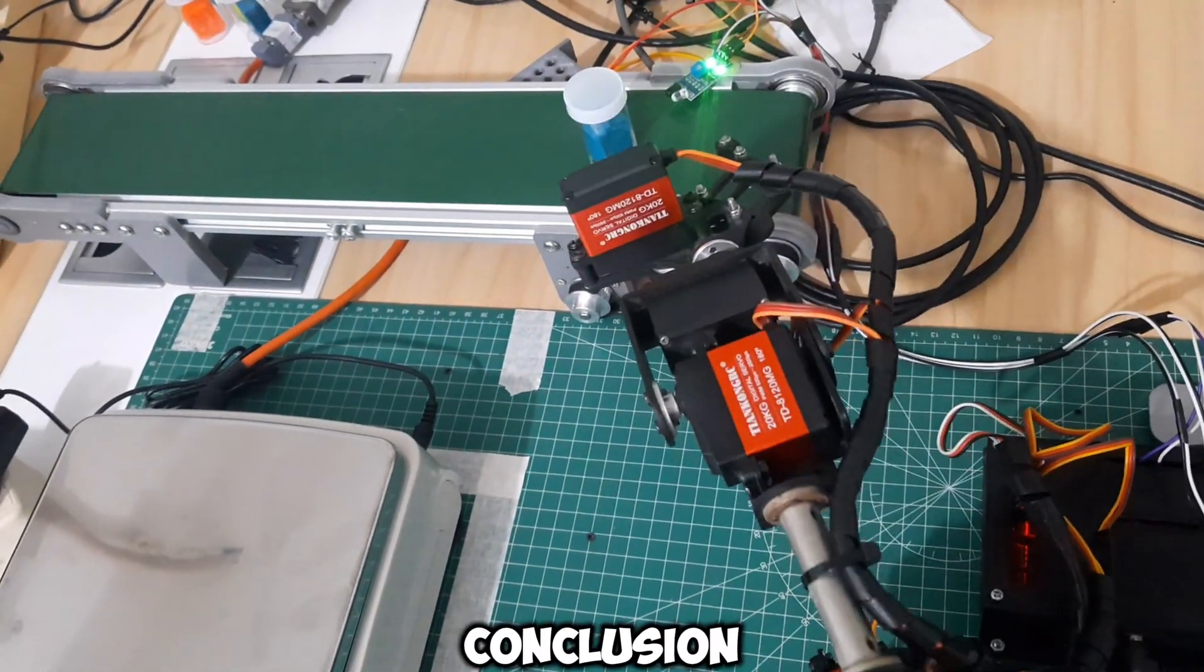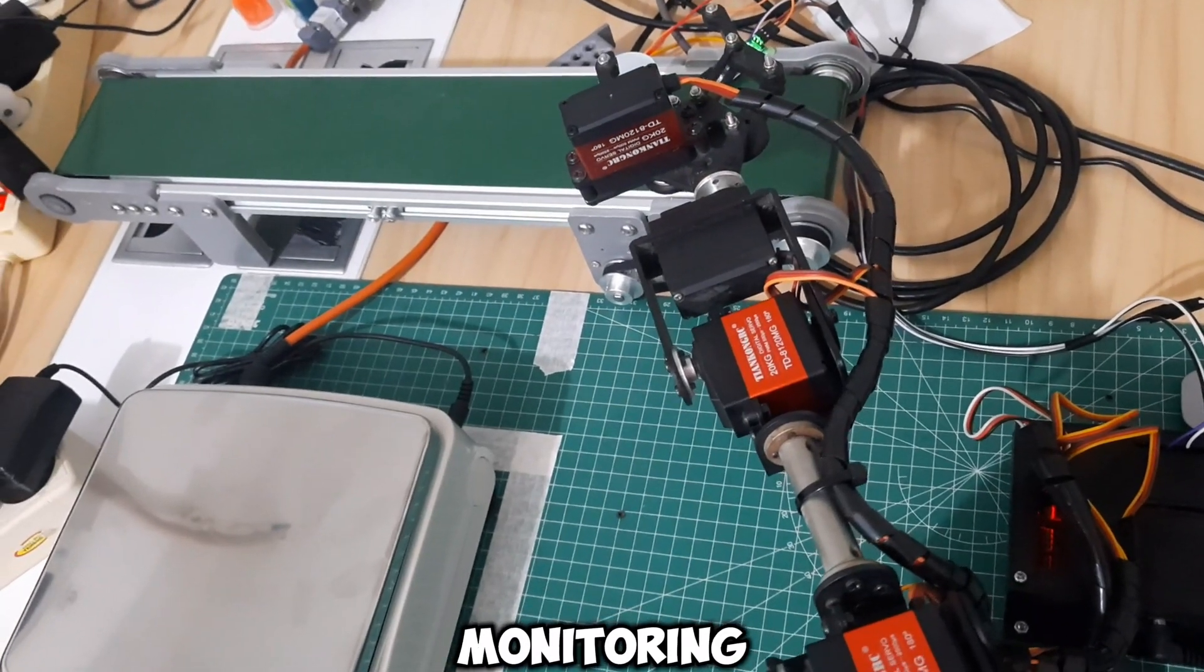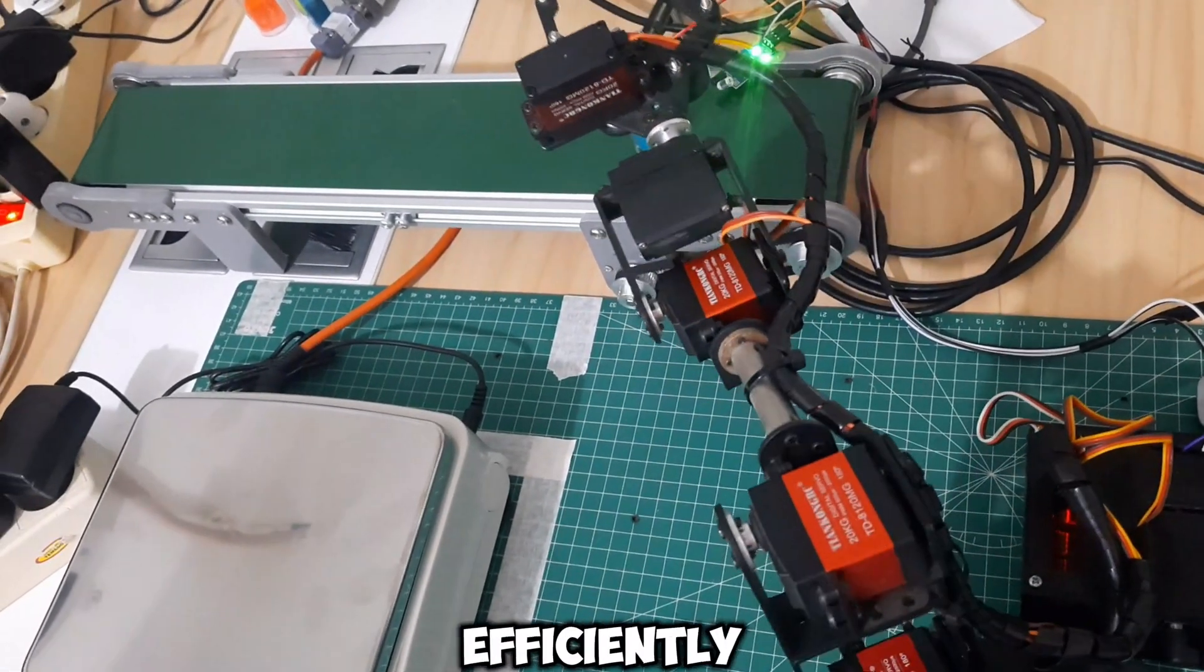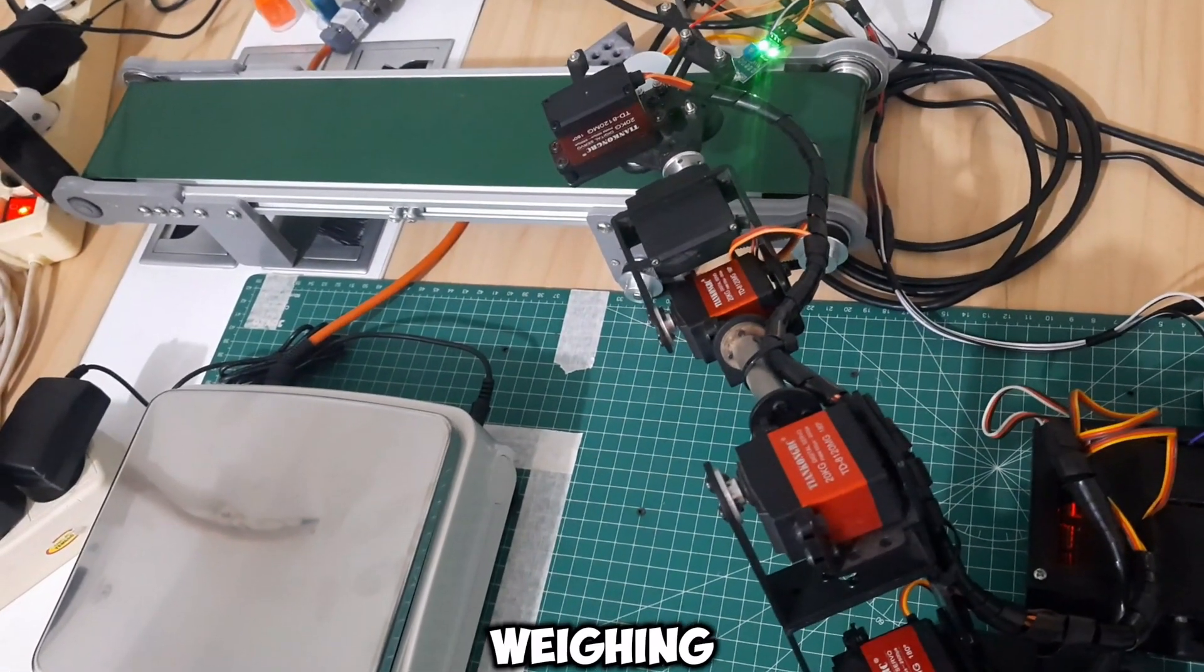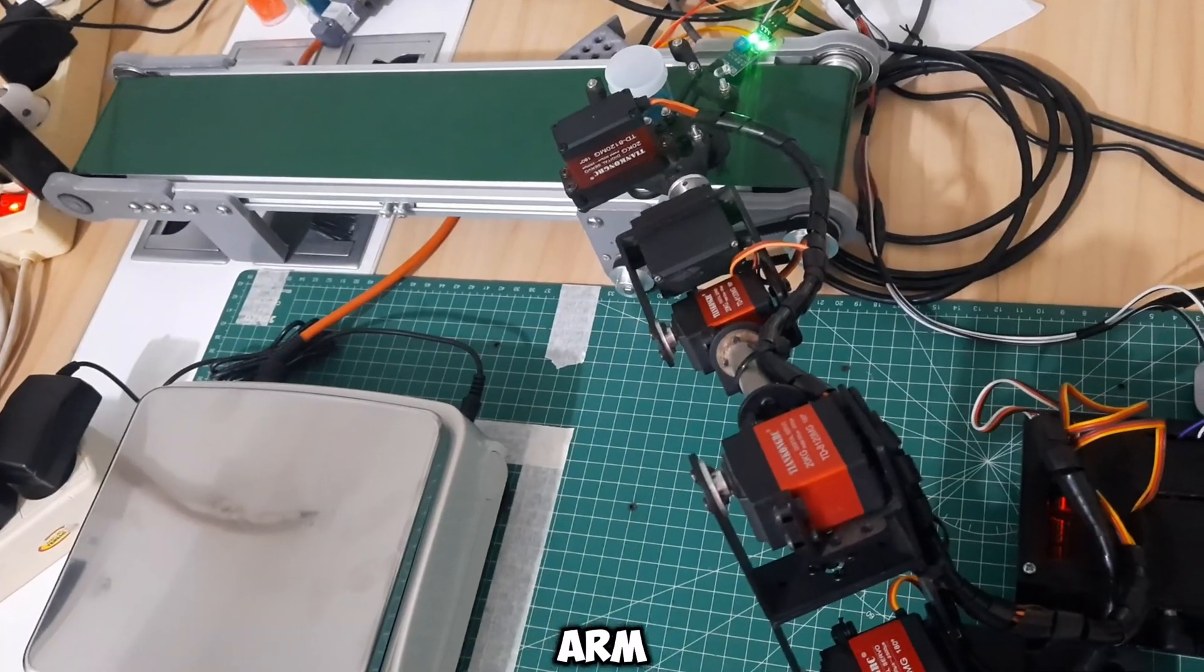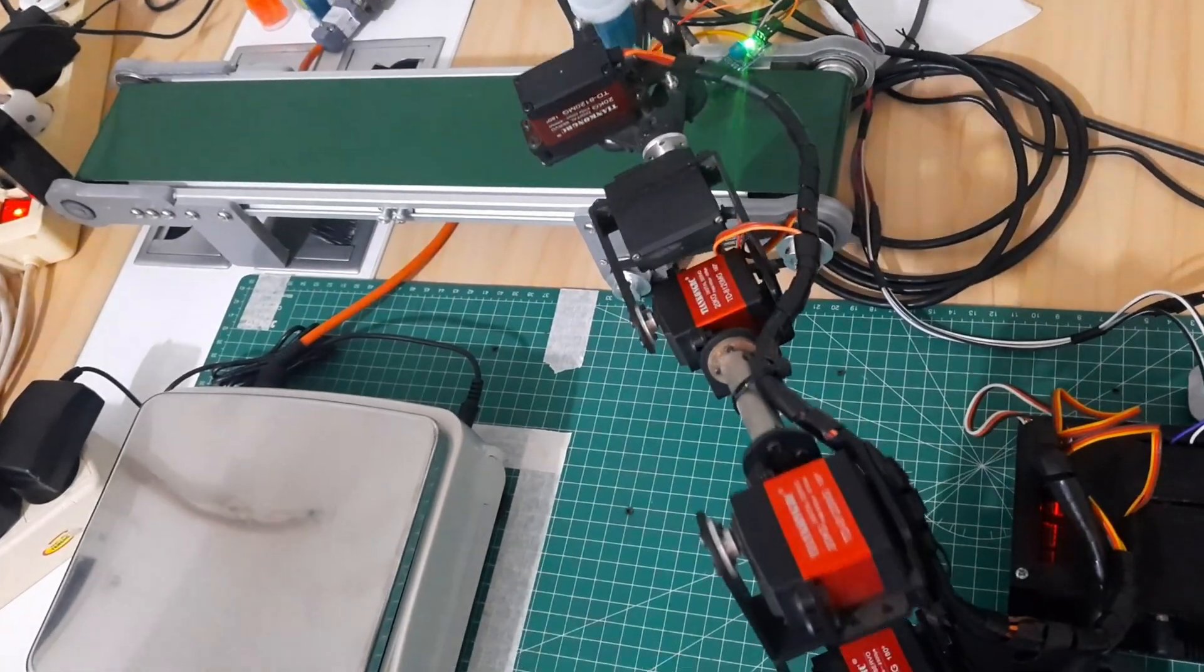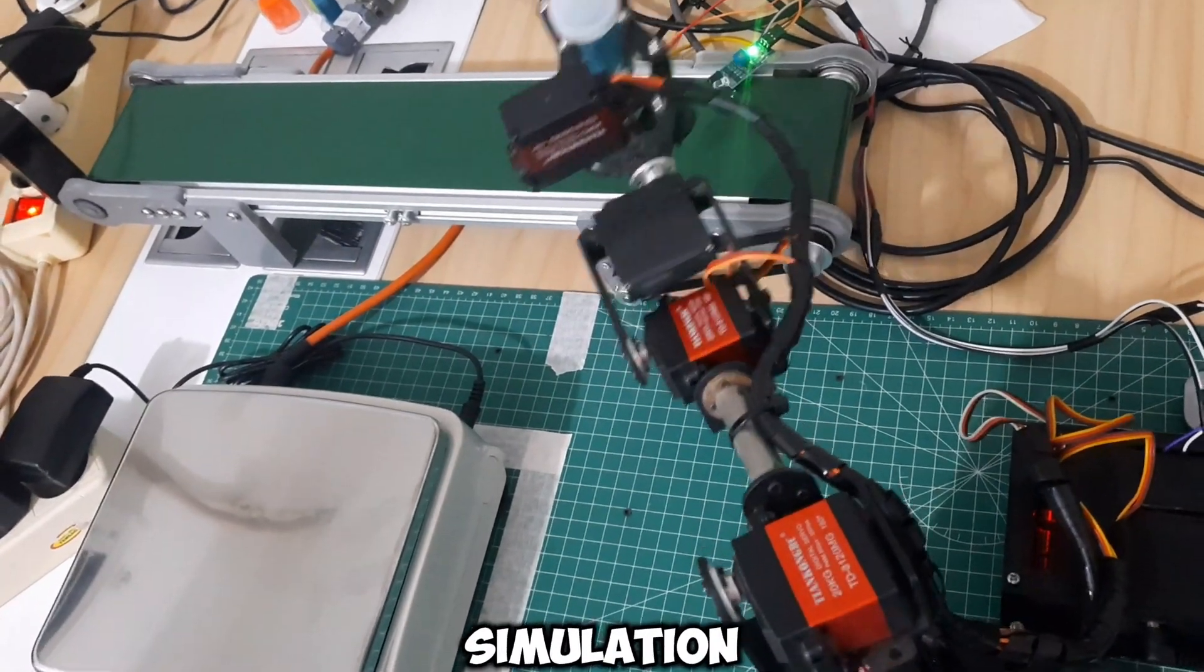In conclusion, we have demonstrated an OEE monitoring system that efficiently integrates weighing and sorting processes using a robotic arm and an analytical balance. Throughout the simulation, we showcased how the system responds to operational changes.